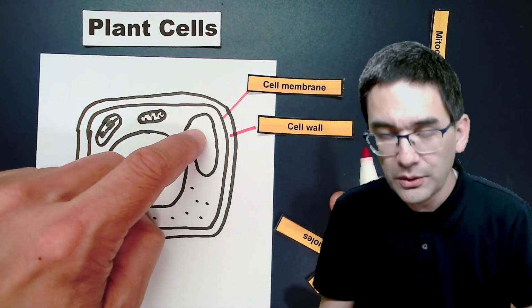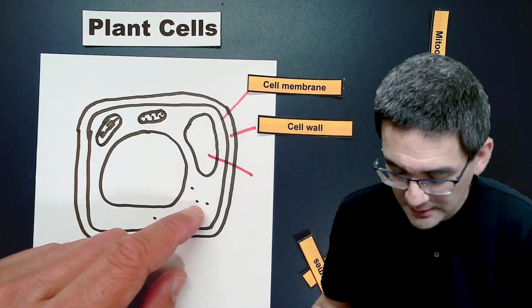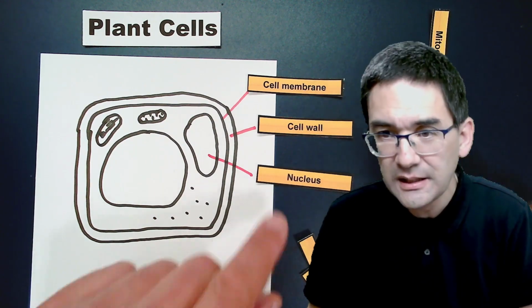So this here, very important, is the nucleus. It's kind of squashed a little bit. But let's do it like this. That's the nucleus, which contains the DNA.